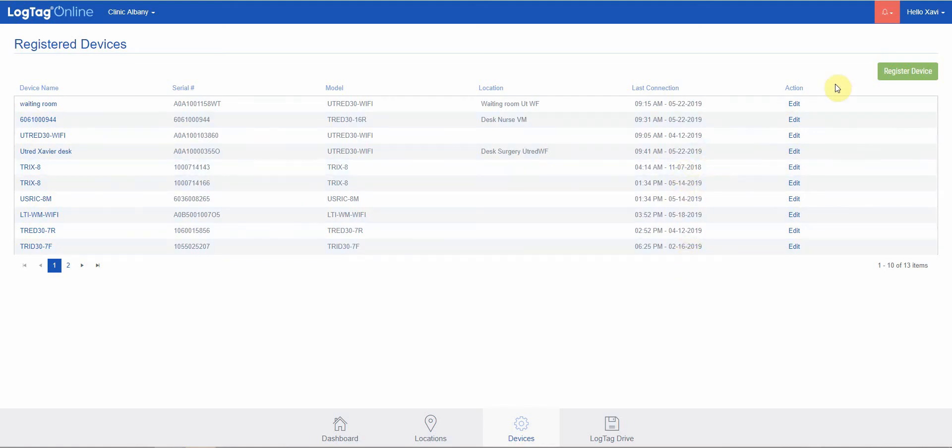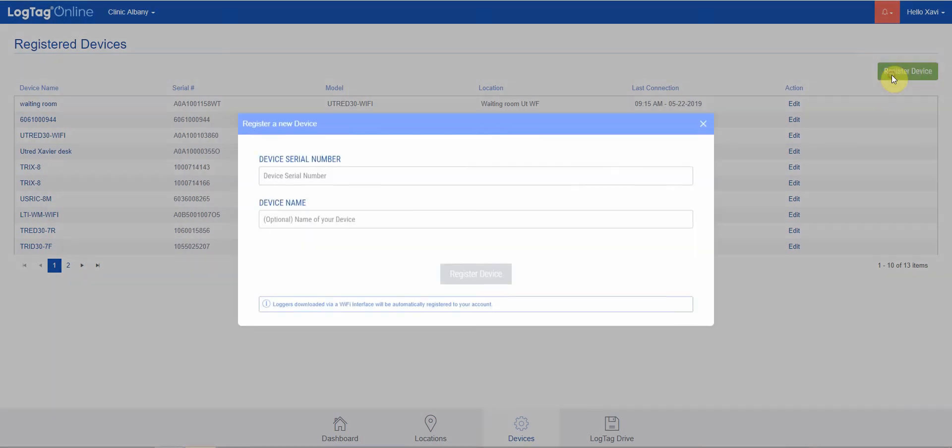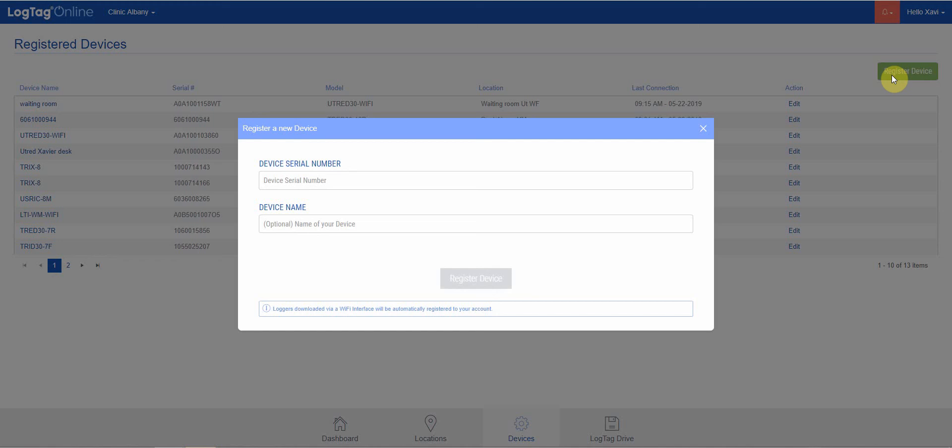If we have a new device that we want to register—for example, if we've purchased a new Utrid 30 Wi-Fi or new warm-out cradle—we can enter the serial number of that device and optionally give it a name, and then register the device.